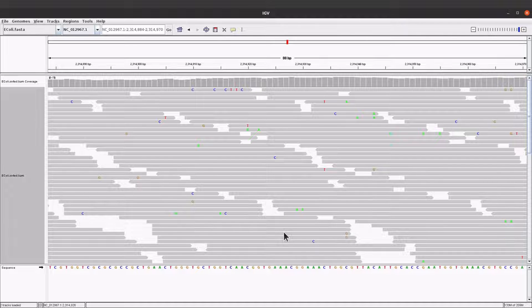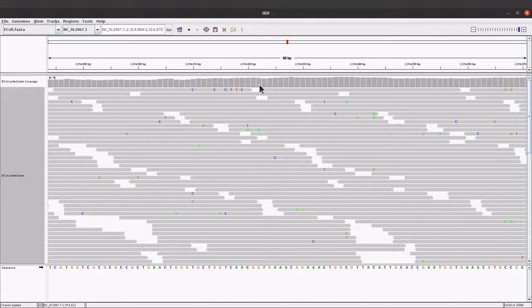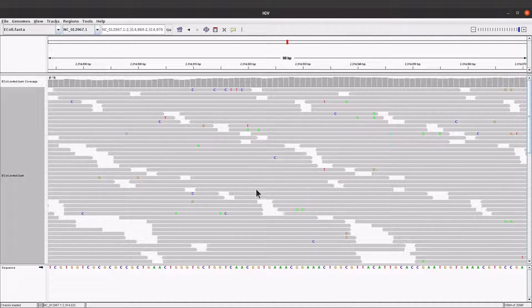Let's check the coverage information. This section here is the coverage - for each nucleotide or base we have the coverage shown here, and some are higher than others. Each of these represents the sum of reads mapped to that position. If you compare two positions and one is higher, that means more reads mapped to that position compared to the other. So it's important to also look at the coverage information.